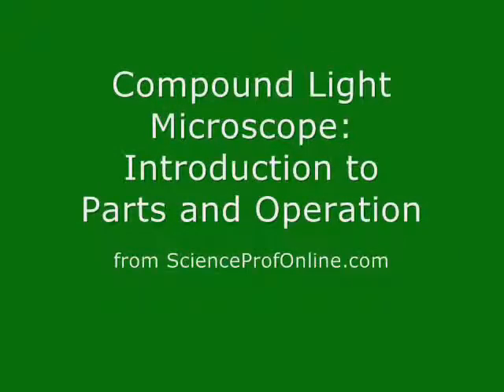This video is an introduction to the parts and operation of a compound light microscope.